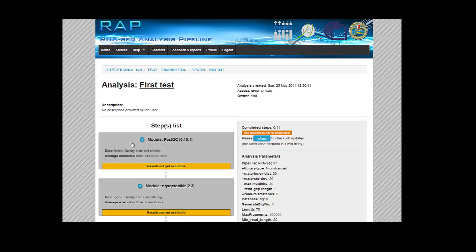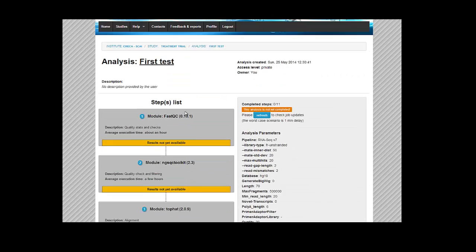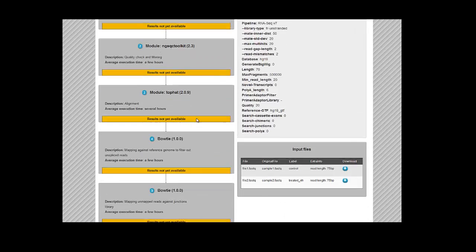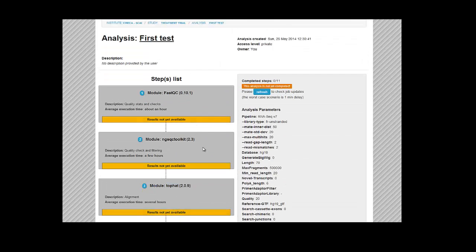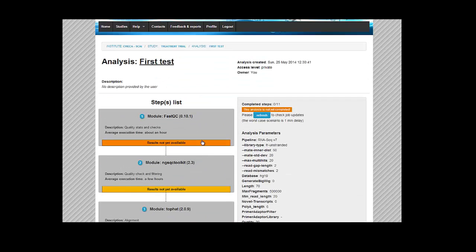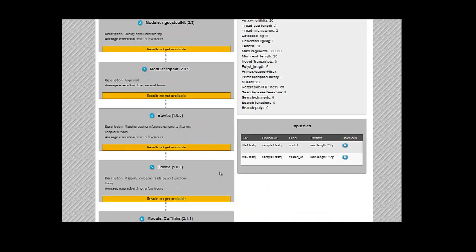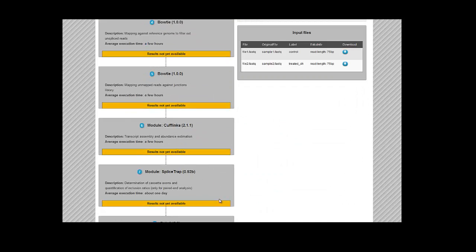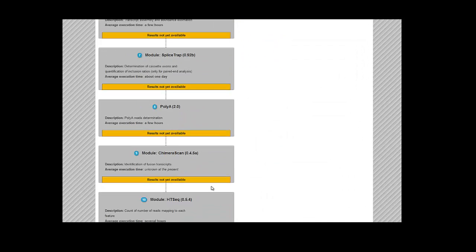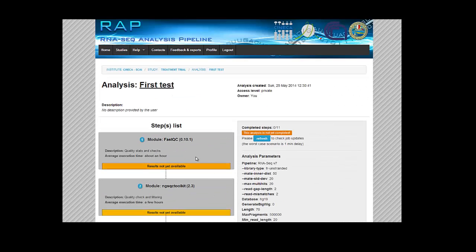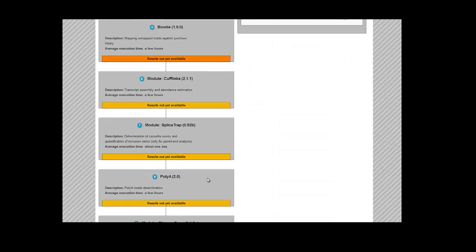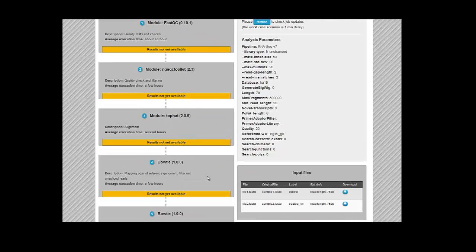So we click on the start analysis button, and our analysis has been successfully created. Click on Go to Analysis. So here is the monitor page where every single step is described with its own status. What happens is that every step is going to be colored in an appropriate color to show the status. The step can be skipped in gray or error in red, and when a single step is completed, it's going to be green.